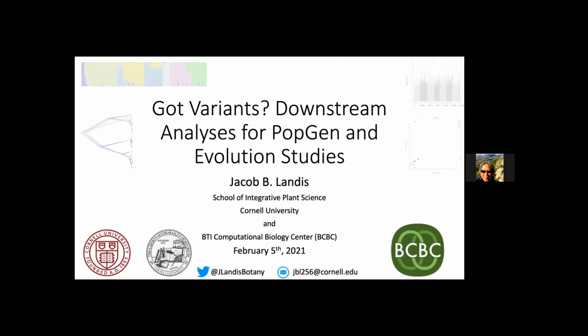Today's webinar is a much requested follow-up from a webinar that he gave in the fall. Dr. Jacob Landis is our presenter, and he had done one on SNP calling to identify variants last fall. And today's webinar, he'll demonstrate how to use CyVerse apps to do downstream PopGen or evolutionary analyses on those variants that were identified.